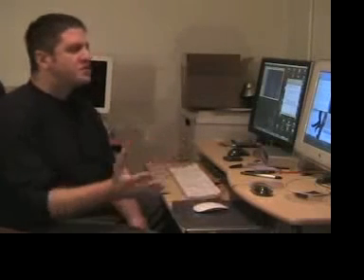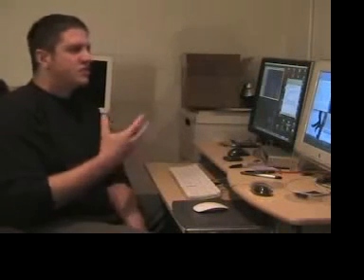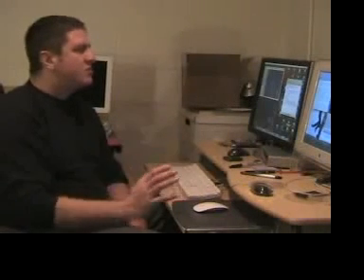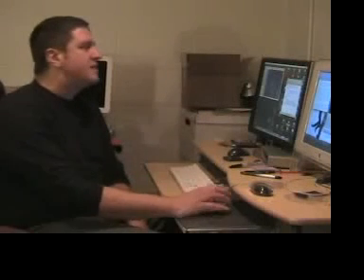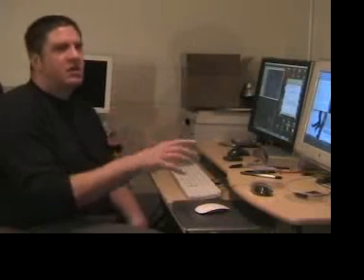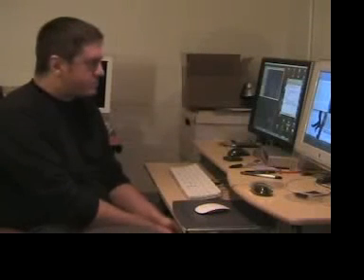Also, you'll probably want to save each image once you've normalized it to keep from having to process it again, should the need arise to consider it another time. If you do need to go back to an already saved normalized image, all you have to do to select the green pixels again is to play the Select Green Pixels action in the Actions palette by double-clicking on the action, or by hitting play once that action is selected. And the selected number of pixels will again appear in the histogram palette. That's pretty much it. That's how you do it. Good luck.